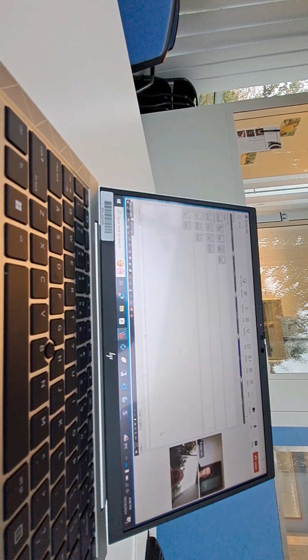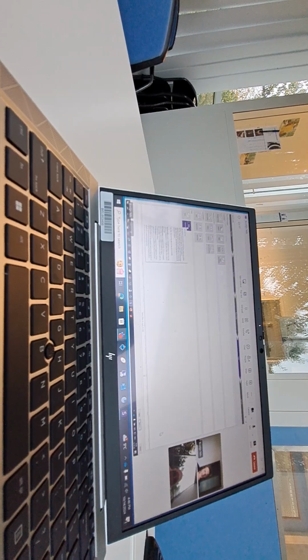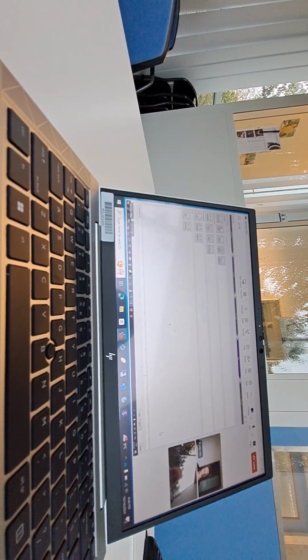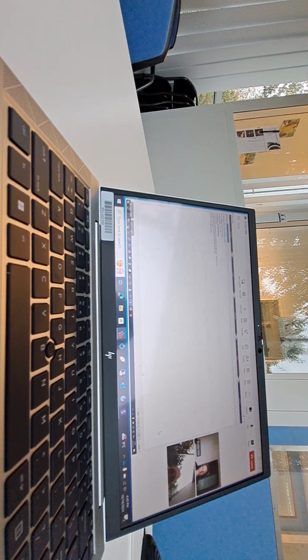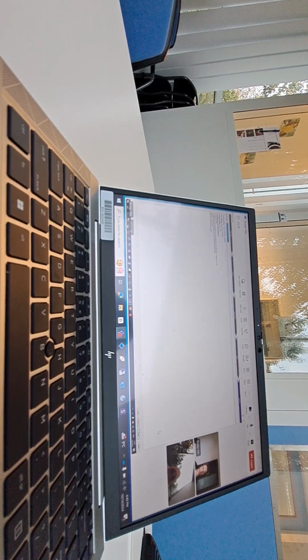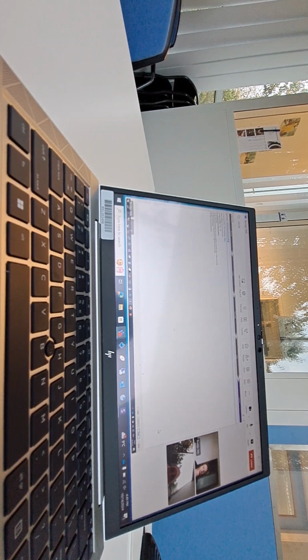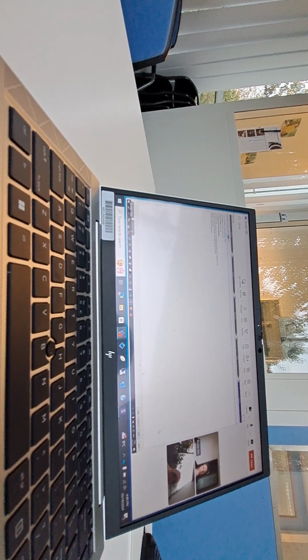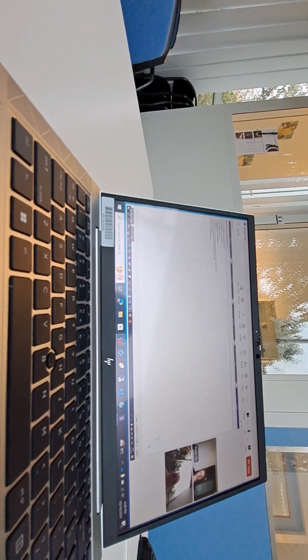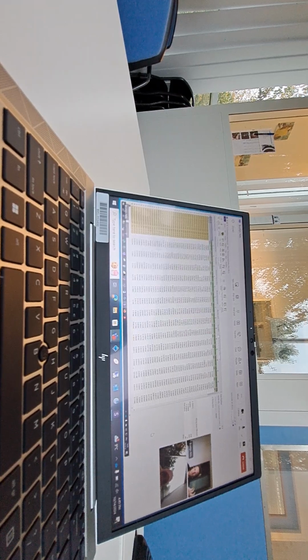So first you click derivative and then you click the SNV, and then next. Here you can, if needed, change the name of the new data set, but you could leave it like this because it will automatically add the name, first derivative, then SNV. Then finish, and it's automatically done.